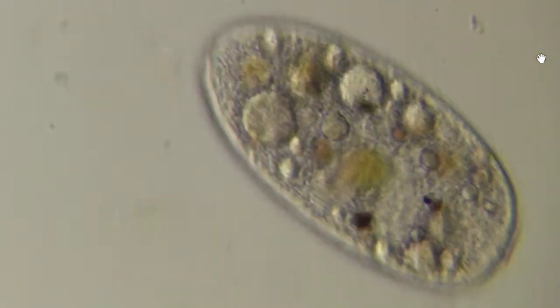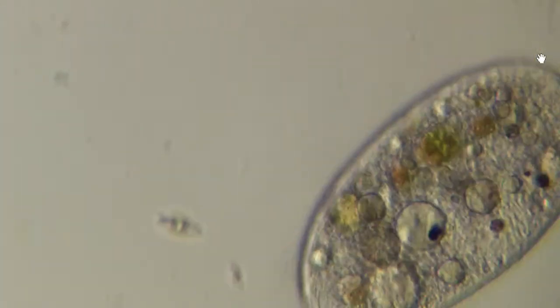Look at all those food vacuoles inside there. It's been a busy boy eating a bunch of stuff. So since they're single cells, they have to do this thing called endocytosis, where they actually envelop part of their cell membrane.